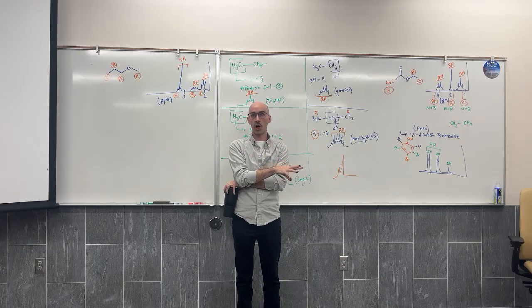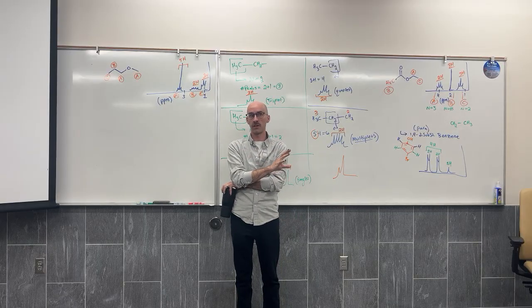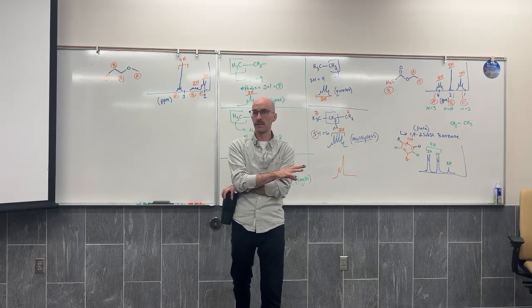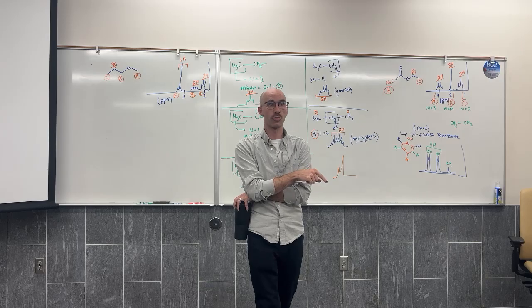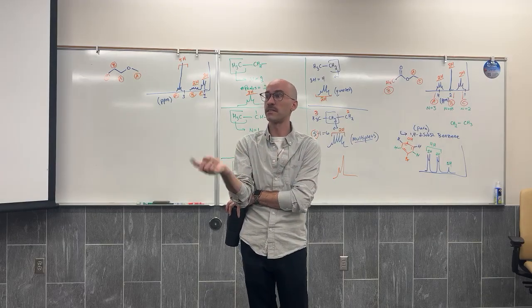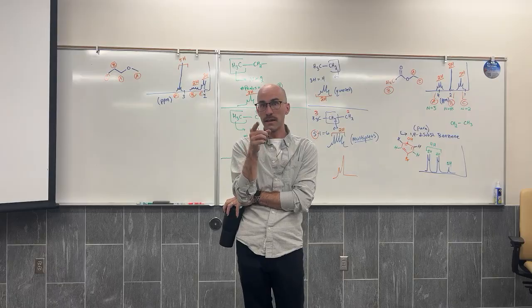The website where I get all of these spectra is called SDBS. It's the Japanese Spectral Database. And it's linked on your external resources for the course. And in lab, you guys will be sent to use this resource.